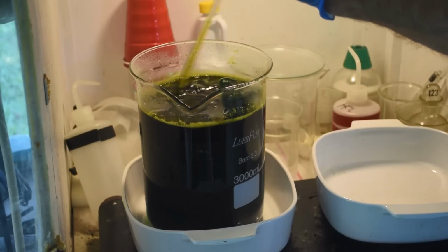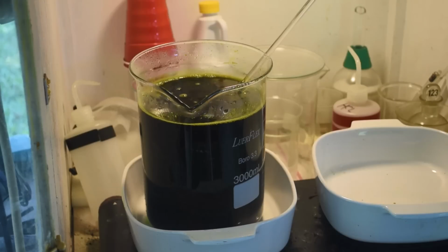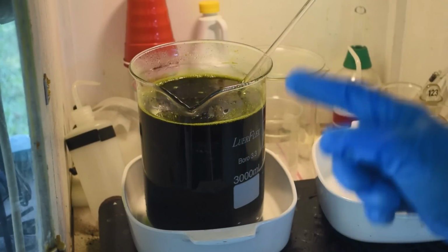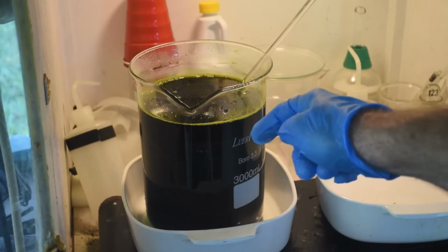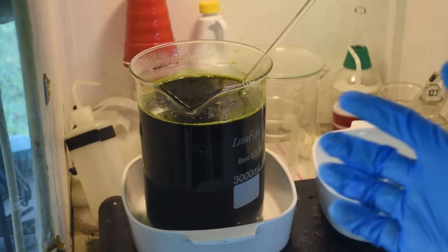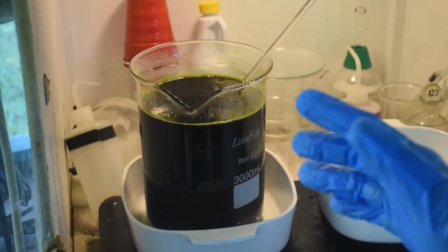So, where do I want to go? And also, we need to denox this stuff. I determined at the end of the last episode we still got a whole lot of nitrate in here. So I've got to denox this stuff. I can't just put a bunch of sulfamic acid in here, otherwise this stuff's just going to bubble up all over the inside of the fume hood, and I'll lose half of it. So what I'm going to have to do is denox it maybe a bit at a time.